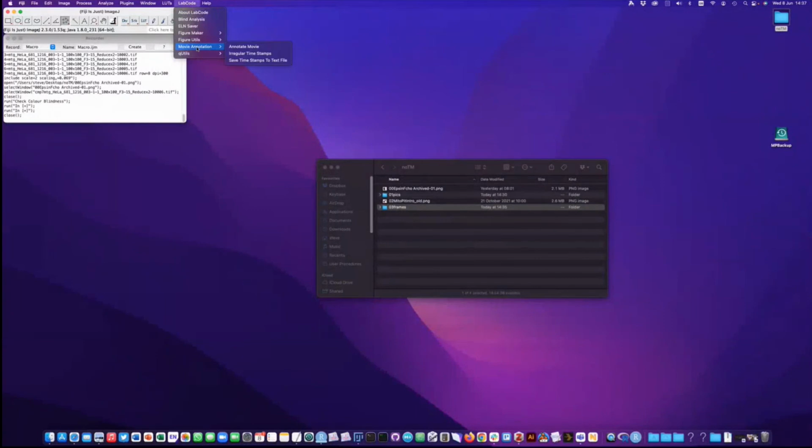We've got some movie annotation tools that, well, they're kind of complicated, but there's a description of how to use it on my GitHub page, or I could do another drop-in some other time. And we have some utilities that are perhaps not so widely useful in there. There's also a blind analysis tool that we use in the lab for taking the names off images and removing any identifying character, so that if any manual analysis needs to be done, you can do it blind, so you don't bias your analysis.